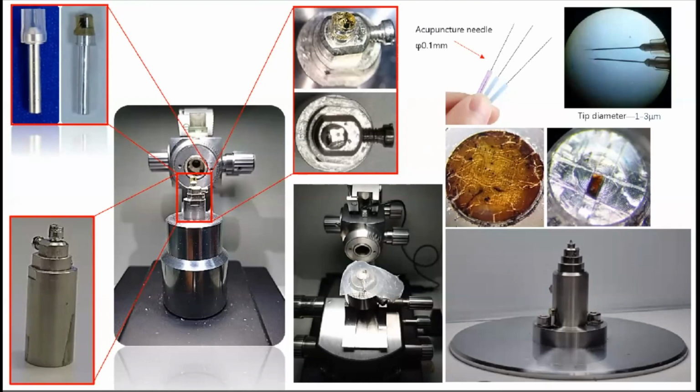So I cut the pipette, put it onto the top of the pin, put the sample in it, added the resin, and lastly, the samples were embedded in fresh resin at 60 degrees for 2 days. And we can trim the sample on the pin.